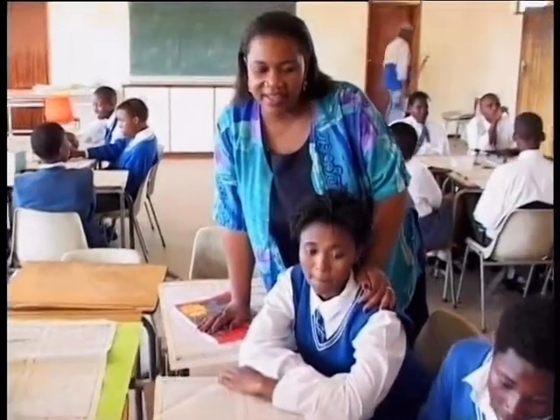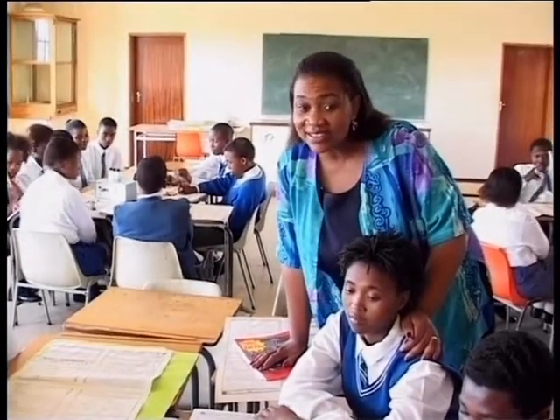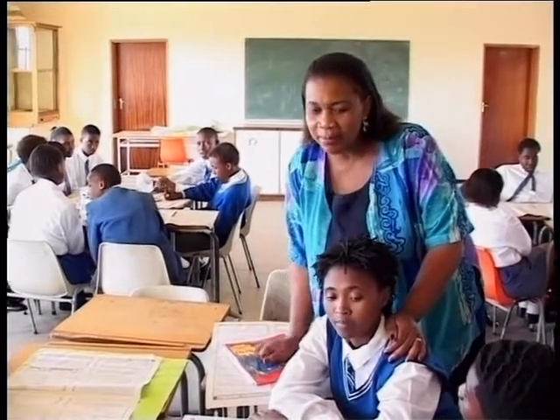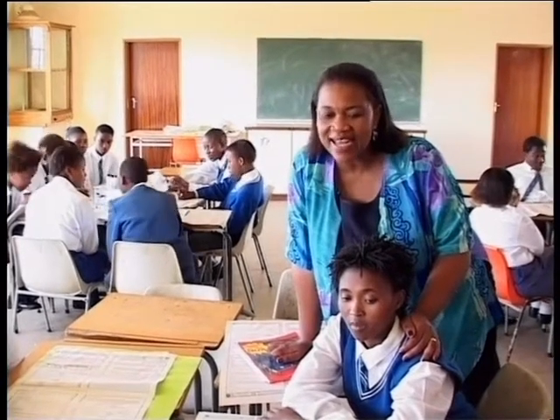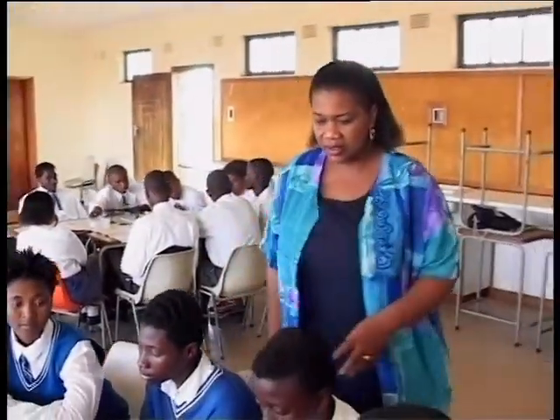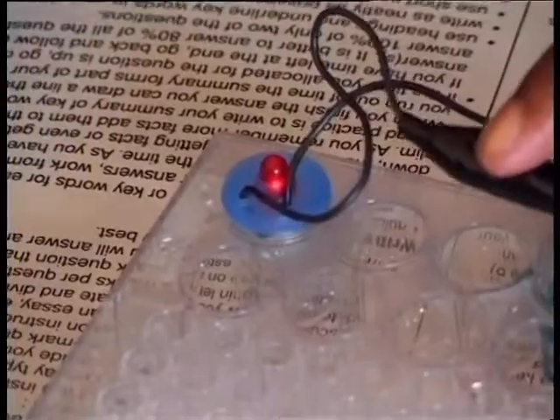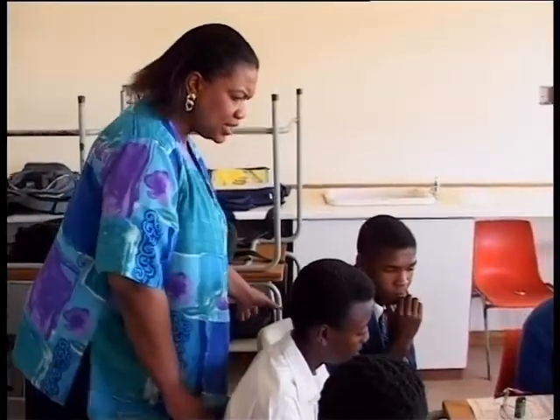At the next group, Mrs. Makapela again recaps the experiment. And it's very interesting because you have observed that water can act as an electrolyte. And if you can still remember, in grade 10, electrolytes are those which can conduct electricity. And you can see that you have this lighting because current has been flowing there. Okay? What have you observed in your experiment? What actually happened in your experiment when you connected your electrodes?